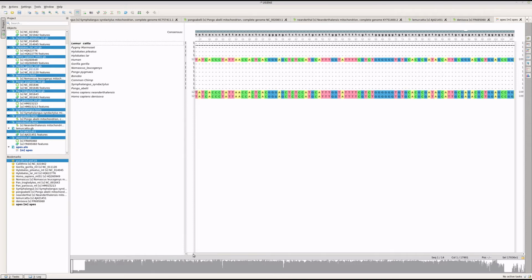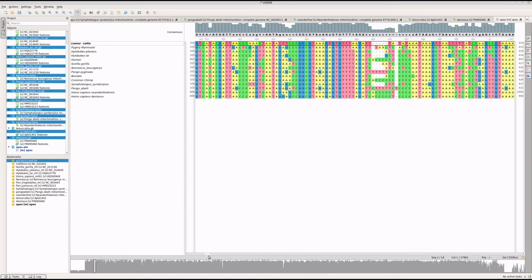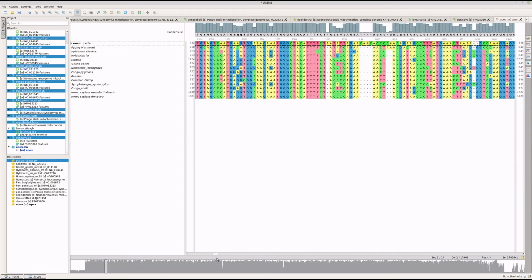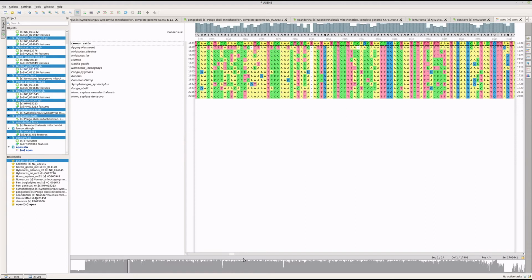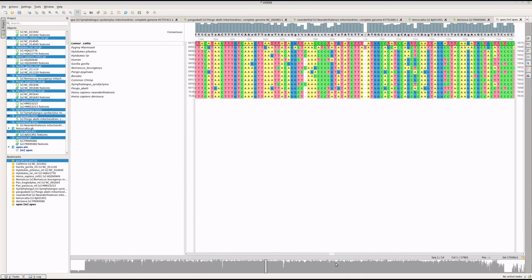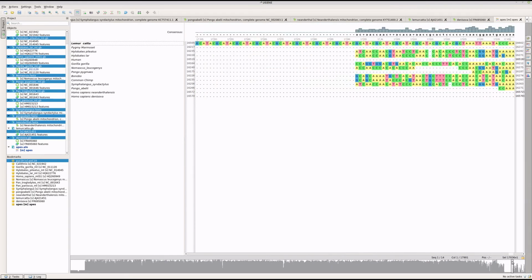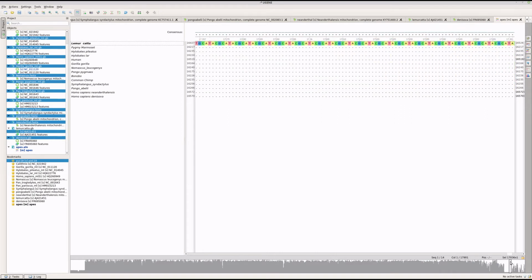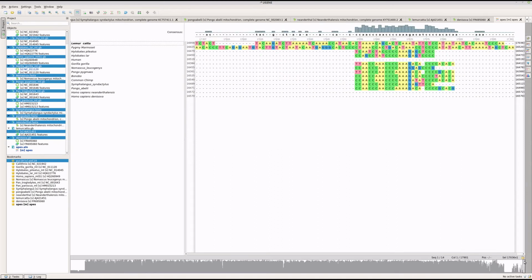And if we scroll along here, we can see what has happened. It introduced a bunch of gaps. You see some colors no longer match up, but the context around these areas is preserved. Right, and that's what we mean by having an alignment and looking at these things, right? So we can scroll along and you see how they mostly match up, and where they don't, there might be a gap or whatnot. So we can scroll along and see what has happened. We remember the longest one was the lemur, and you can see how it just sort of is still up there at this point, with inserting a gap for everything else and whatnot that we see on here.